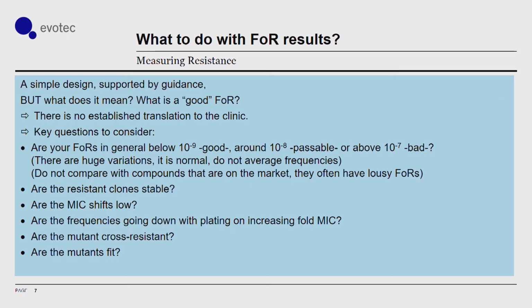So this rather simple experiment, when you have to consider the results, actually takes a bit more finesse. First, as has been said before, there is no established translation to the clinic. So just what is a good frequency of resistance, there's no good answer to that question, of course. Still, there are key questions to consider.